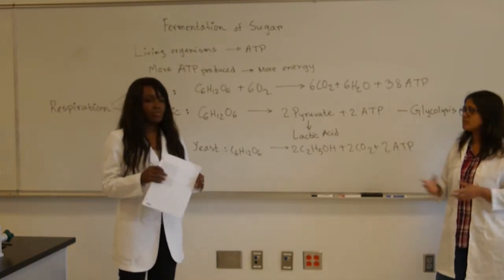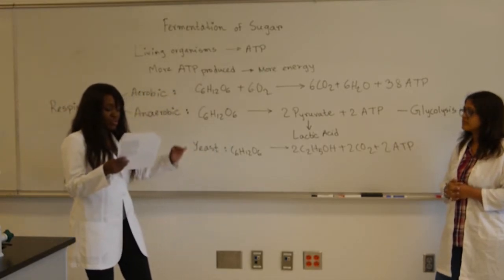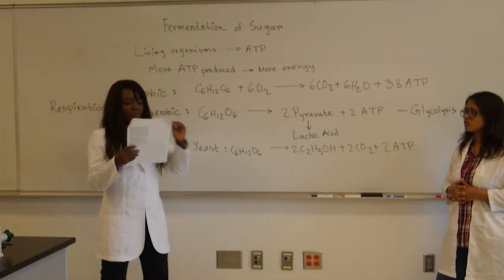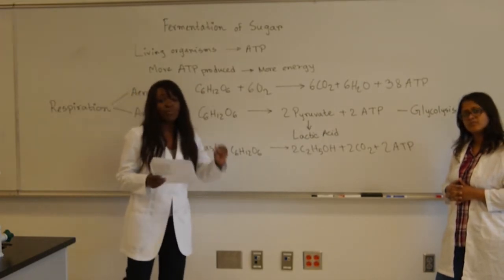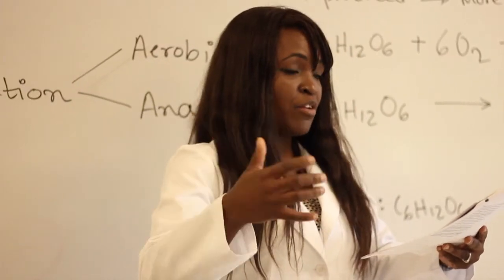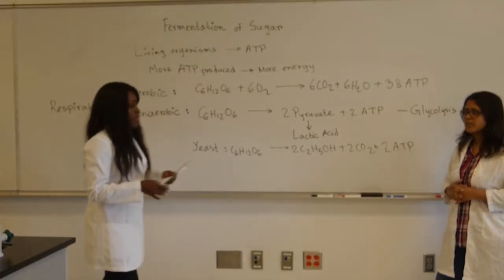I guess sucrose is the standard of the experiment, right? Yeah. If you look at your lab protocol on page 4, it tells you to assume sucrose produces 100% ATP, and then you compare the different sugars by their percentage. So for sucrose being 100%, glucose is actually only 74% of what sucrose will produce. Say you're an athlete and you wanted a lot of energy. It'd be better for you to have sucrose than glucose because you get more ATP from sucrose. More energy. Yeah, more energy.